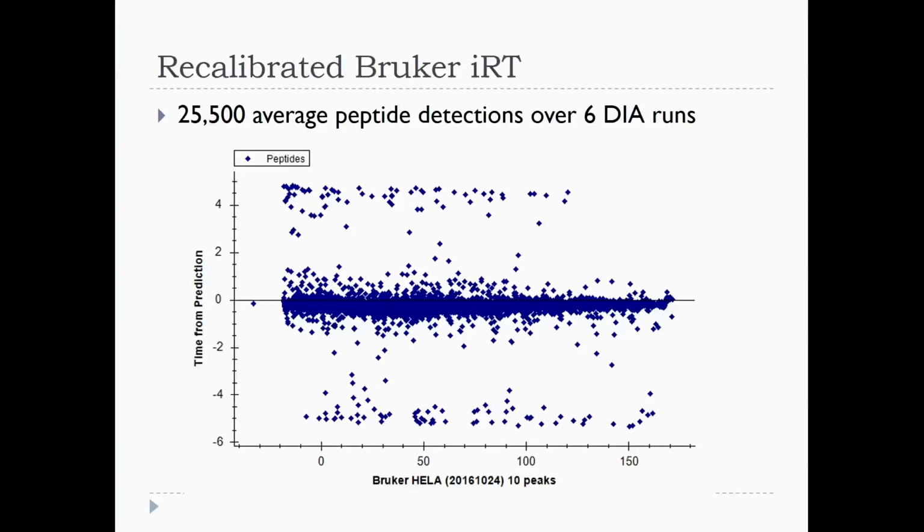I just last night came to a weird understanding of another phenomenon here. We looked at this plot and we said, wow, cool. They're all really close to the right place. But we also said, there's something strange about that plot. What's strange about that plot?